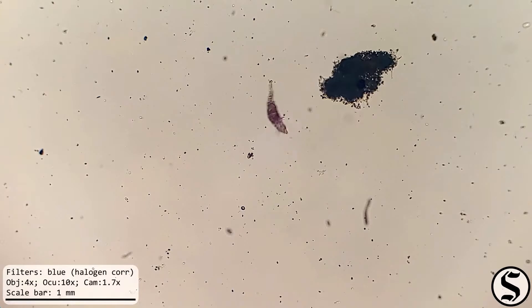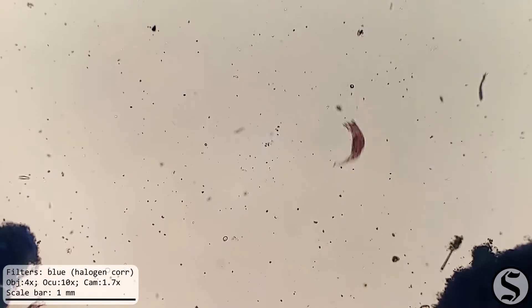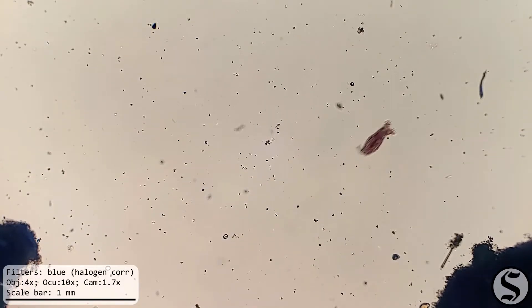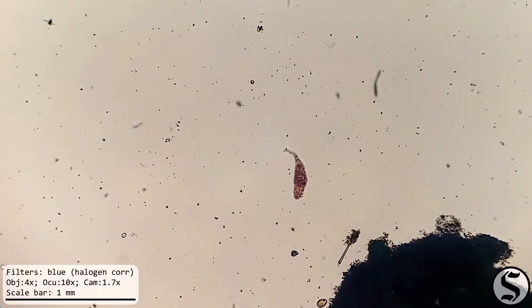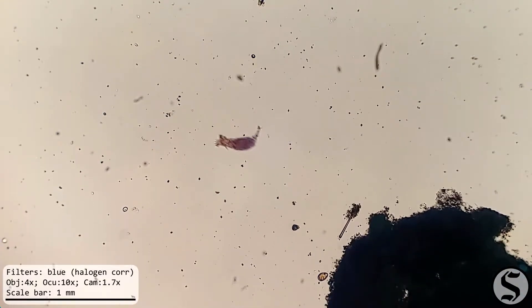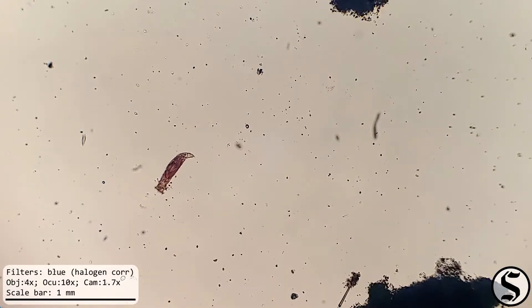Now under the microscope, we've got a rotifer swimming around. This is a bdelloid rotifer, which we can tell just from the way it's moving around.